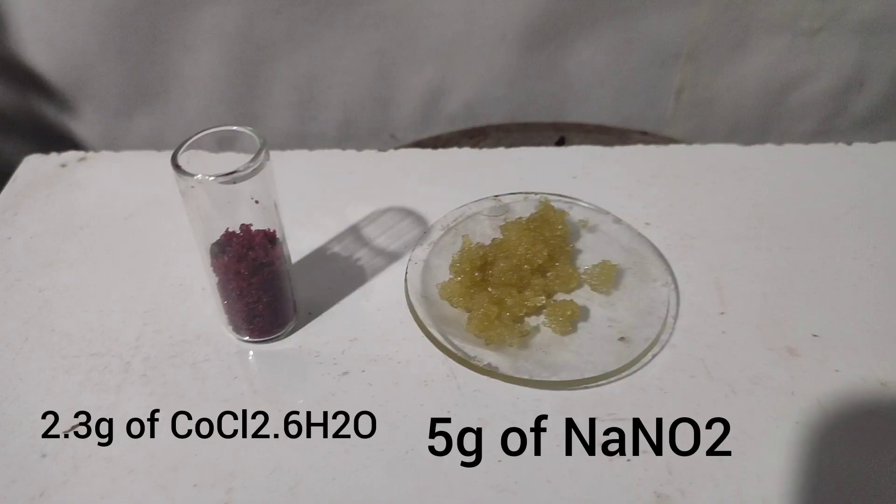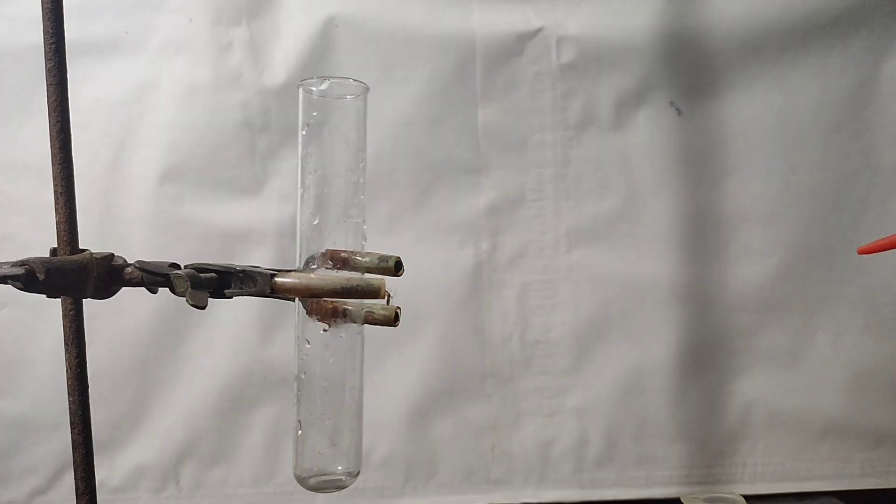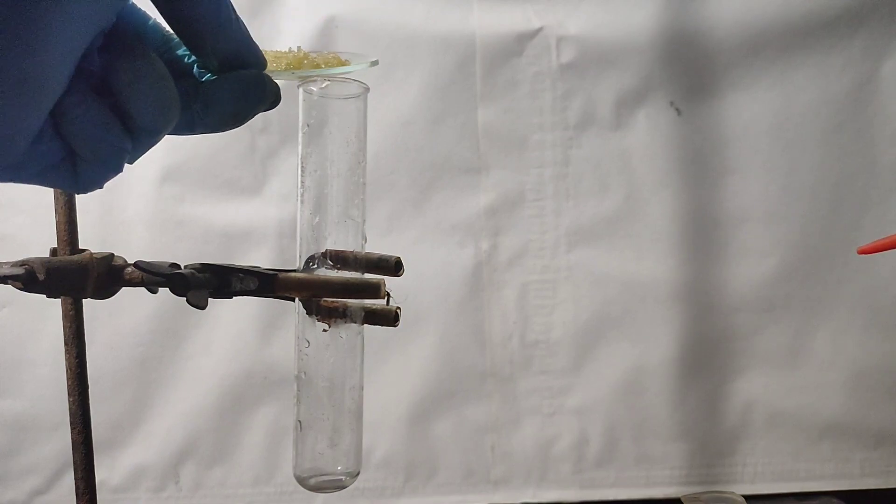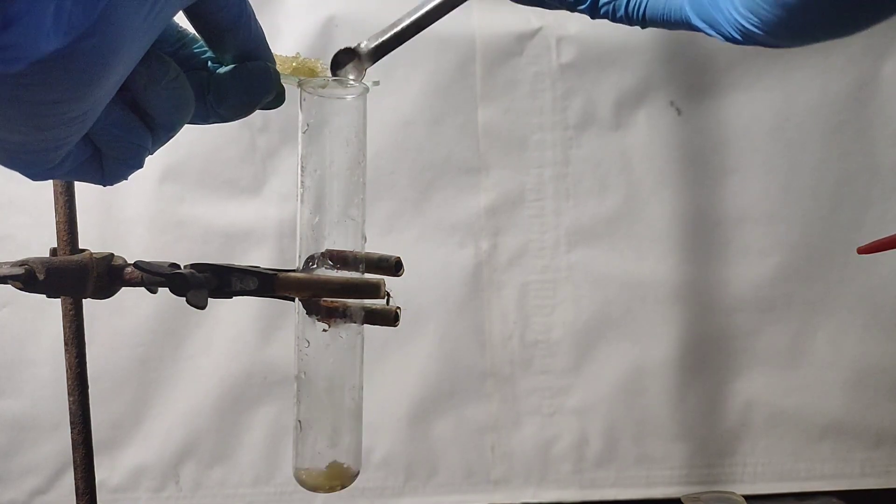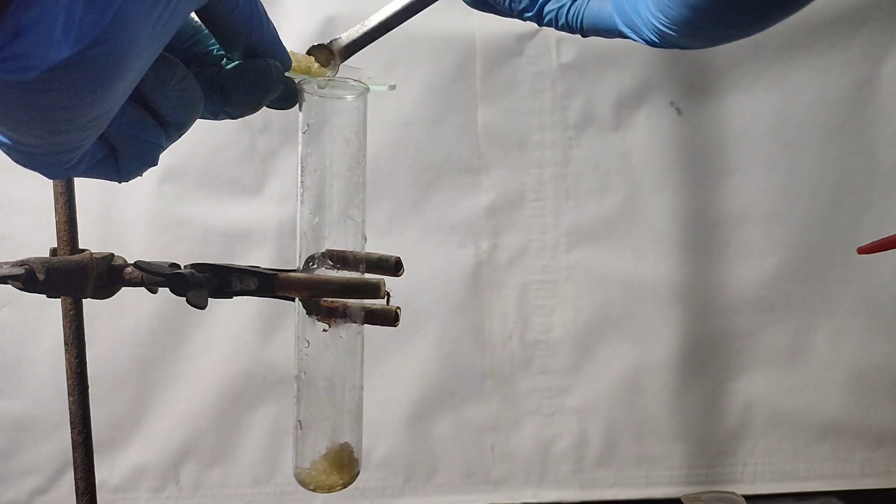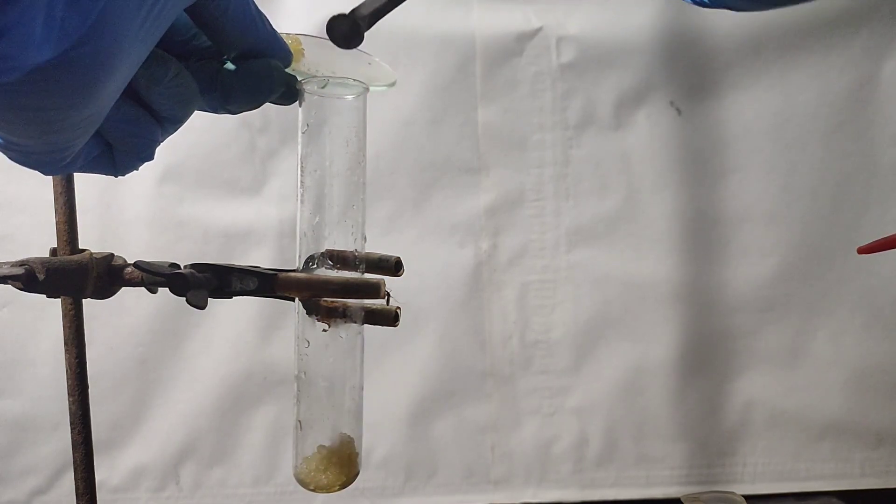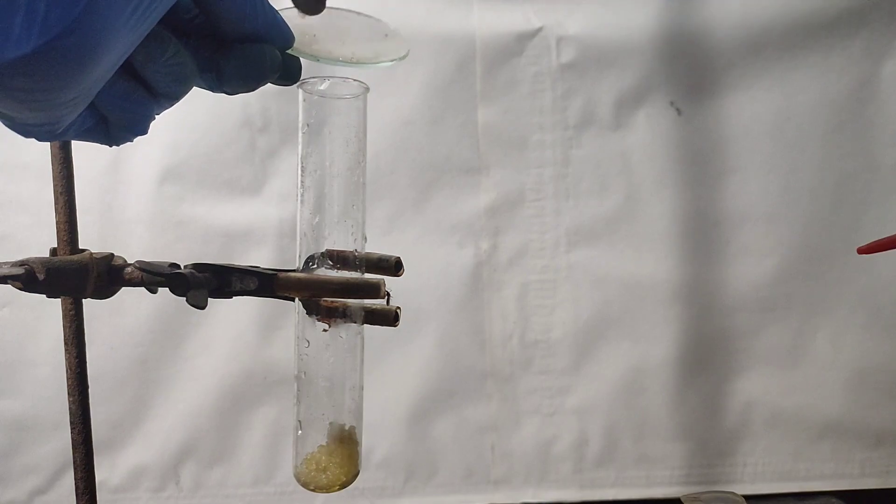I measured out 2.3 grams of cobalt chloride hexahydrate and 5 grams of sodium nitrite. Alternatively, 1.75 grams of cobalt nitrate can also be used. The literature I was following suggested using cobalt nitrate, but since I didn't have cobalt nitrate, I used cobalt chloride.